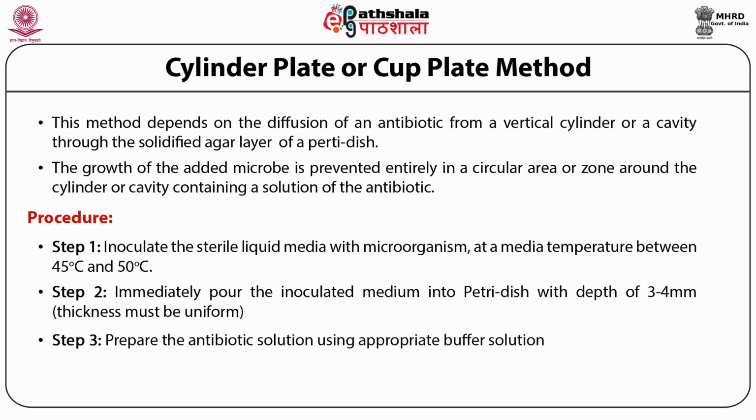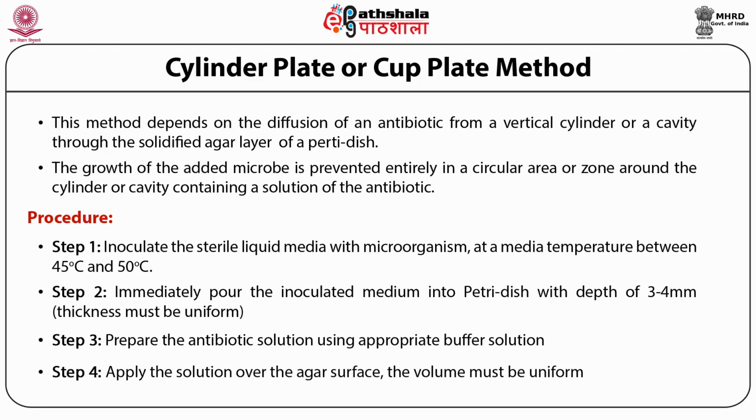Step 3. Prepare the antibiotic solutions using appropriate buffer solutions as per the pharmacopoeial procedures. Step 4. Apply the antibiotic solutions and test solutions over the agar surface using cylinder. The volume of the antibiotic solutions or test solutions must be uniform.